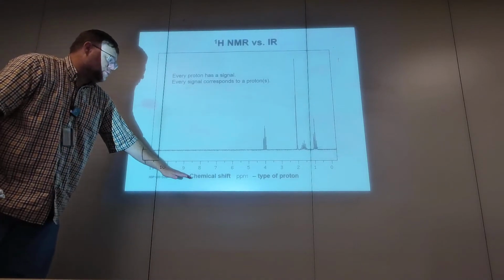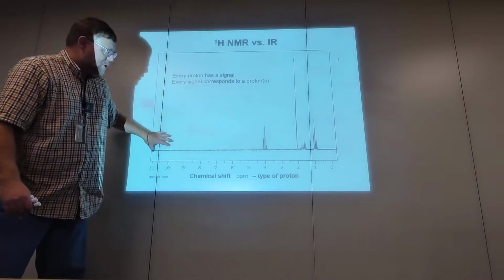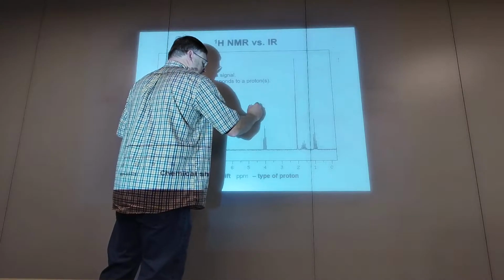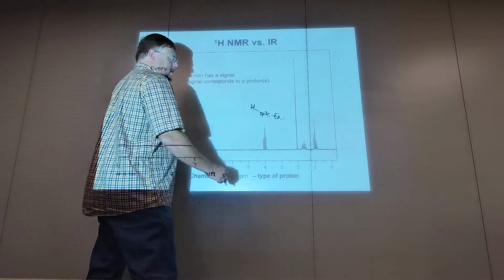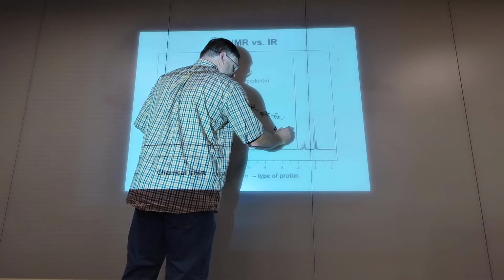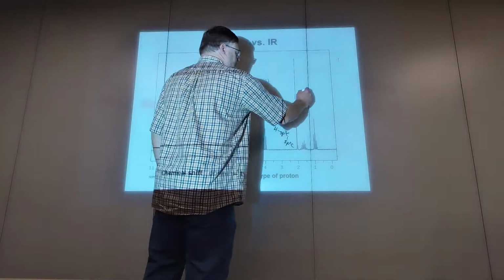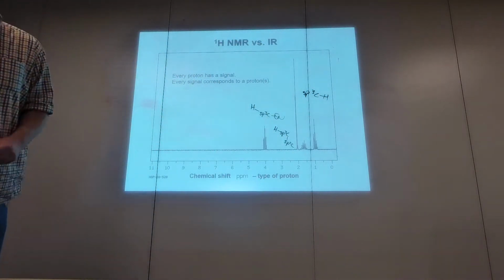Okay, so the other thing is I did all that with chemical shift alone, right? The chemical shift is the frequency axis: no protons on sp2 carbons, protons only on sp3 carbons. This is probably going to be an H on an sp3 carbon bonded to an electronegative atom. And then 2 to 3 is an H bonded to an sp3 carbon that's bonded to an sp2 carbon, and then down here is just sp3 CHs. All right, that's the chemical shift information.